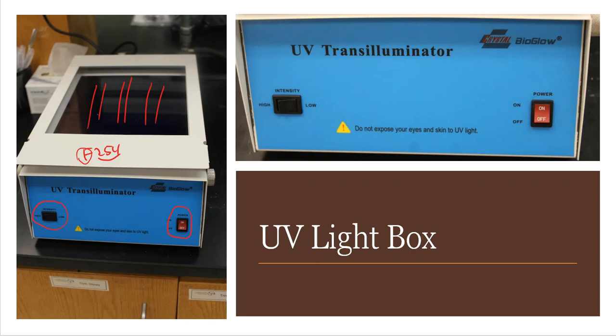So the way that I operate this sucker is that this lid actually pulls up, right? And it pulls up toward my face because there's a protective screen on it. So that way my eyes do not get burned by the UV light bulbs. Same reason that you wear goggles in a UV light bed or a tanning bed, I hope. So you don't want to burn your eyes or damage your eyes. And I also don't want the UV light onto my face, where I will give myself a sunburn within 2 minutes because, you know, I'm fair-skinned and freckled. So I'm going to get sunburn, and I'm going to get it quick when it begins to happen.